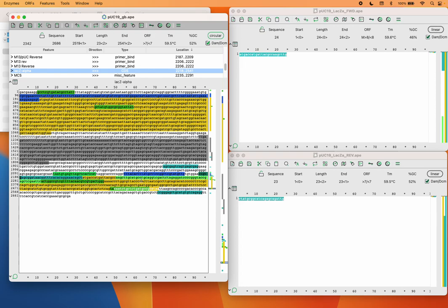We did that. Sometimes it takes a little bit of wiggling. Sometimes there's compromise that has to come into play. And unfortunately, you have to do that sometimes. But as long as your forward and reverse primers have similar properties, usually within 3 degrees melting temperature, then your PCR reaction will generally work.